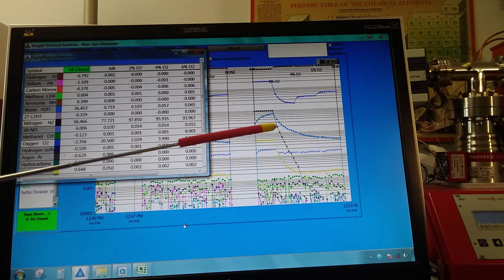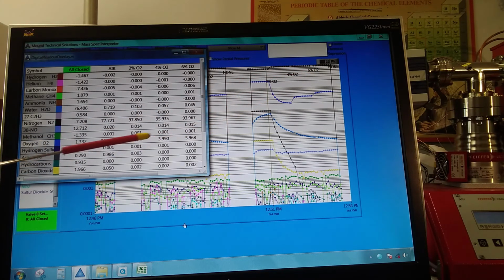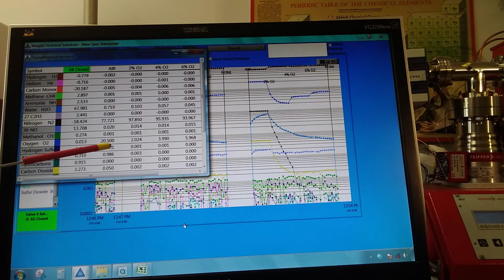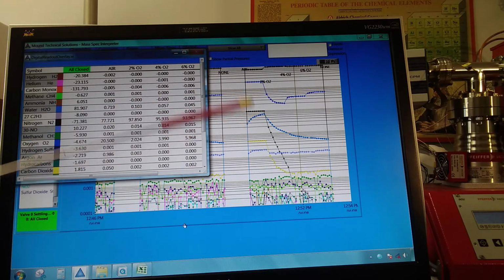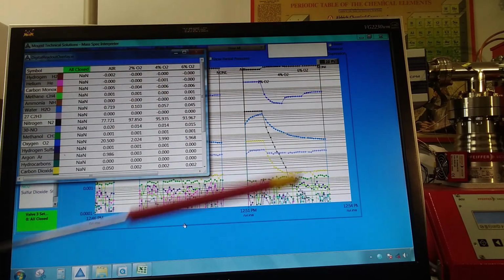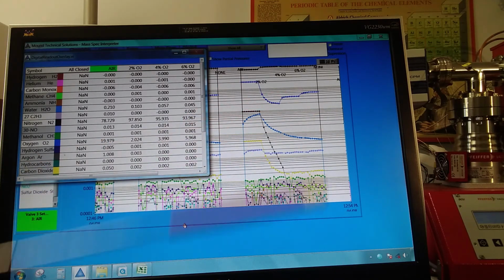So we're able to measure some other things going on in our processing cells other than just oxygen. But we've seen that we're able to transition, certainly within our 30 seconds, to get the appropriate answers of 2%, 4%, and 6%. And here's our 21% minus the balance that was taken by the water vapor. And so we're getting very good measurements very quickly in less than 30 seconds per capillary. So we can look at how many boxes we want to sample, times 30 seconds each, and that'll give us a time for our sample cycle time.